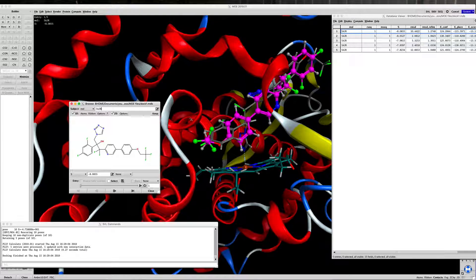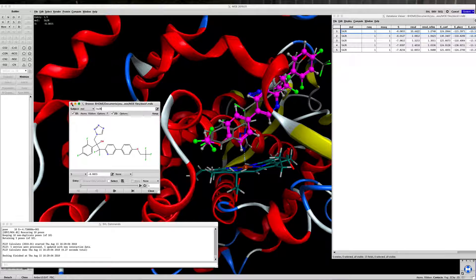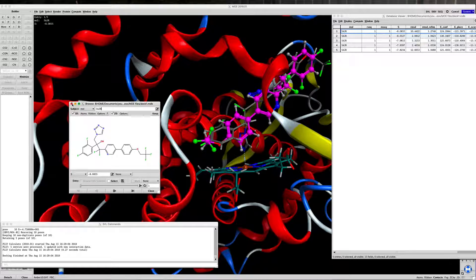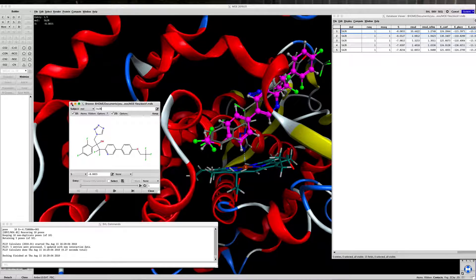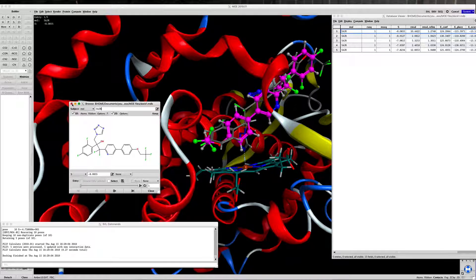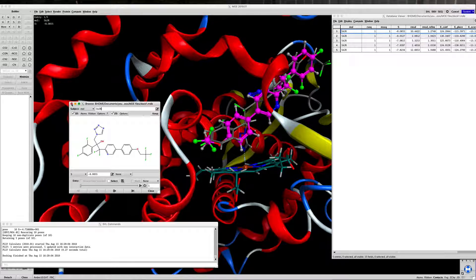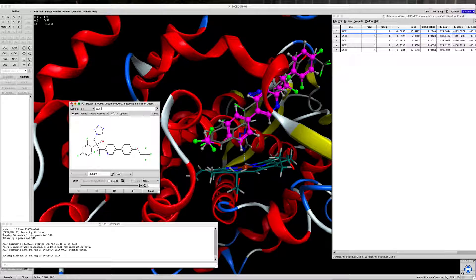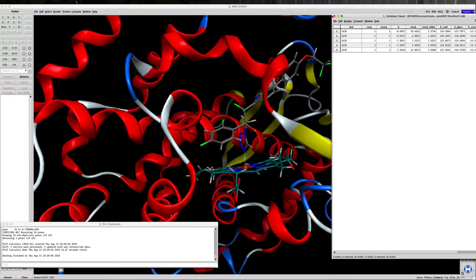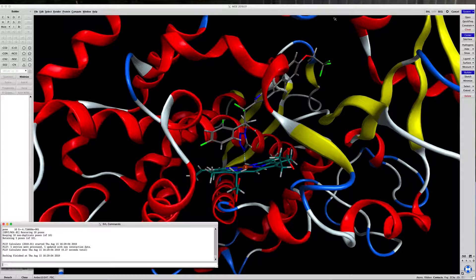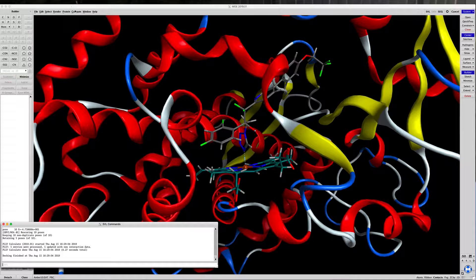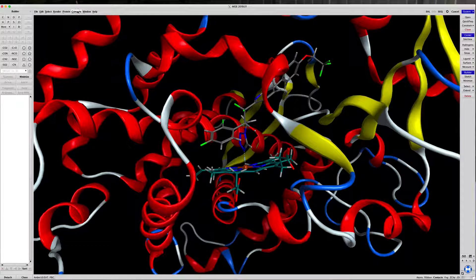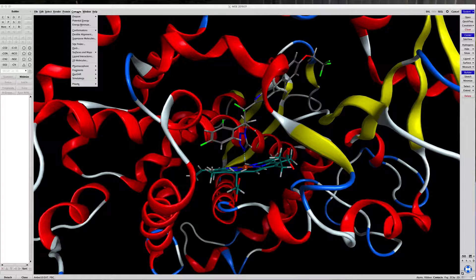So what we're going to do to make the interaction with the iron, the desired interaction, is create a pharmacophore query that will direct the docking. So to create a simple pharmacophore, go to Compute, Pharmacophore, Query Editor.